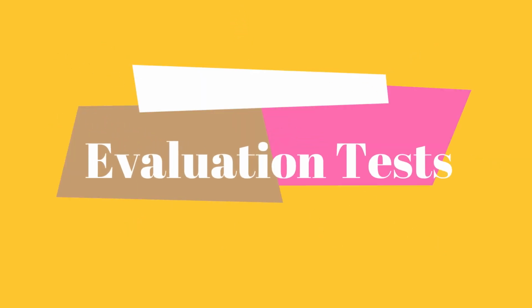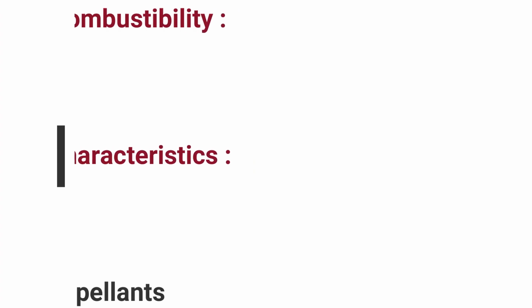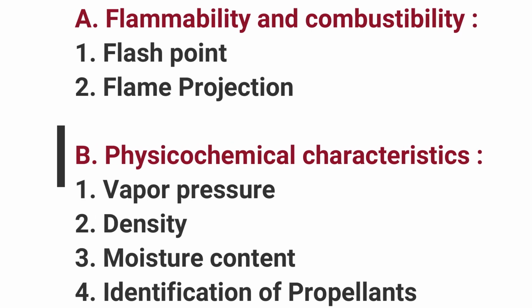Hi everyone, today our topic is evaluation tests. Here we have different types of evaluation tests available. They are flammability and combustibility, in which flash point and flame projection are checked. Next is physico-chemical characteristics, in which we have different tests: vapor pressure, density, moisture content, and identification of propellants.